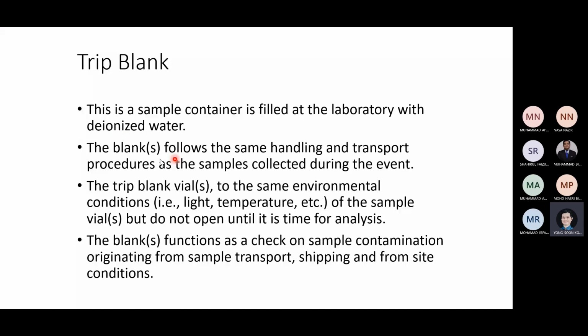You collect your water sample, and then you bring it back. So this whole container is filled in the lab, brought to the site, and brought back without being opened. You only open it when the analysis is conducted. Now this is called trip blank. It is to determine if there is any possibility that contamination happens when you commute from the lab to the site and from the site back to the lab.